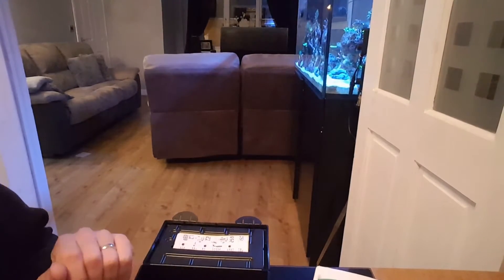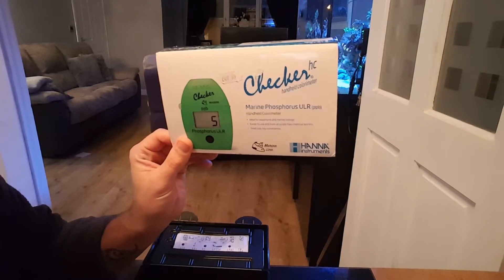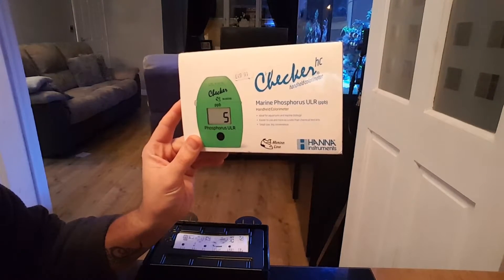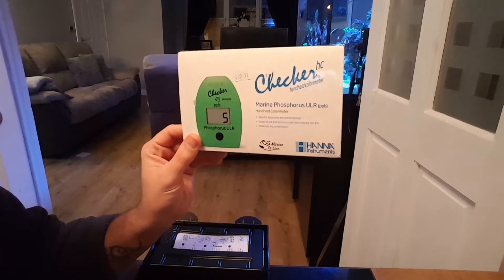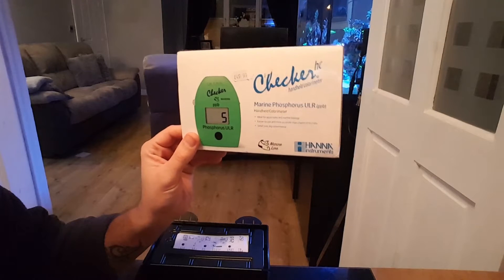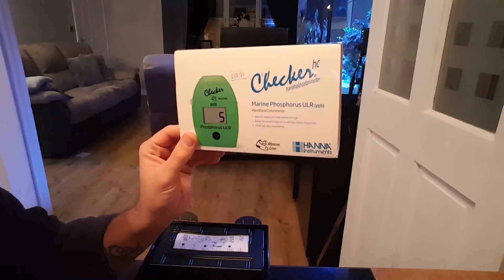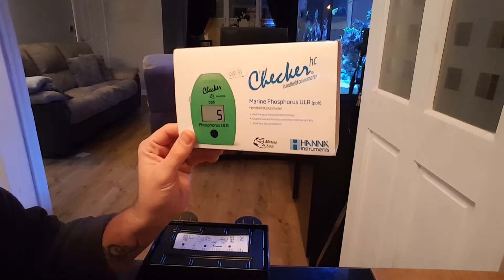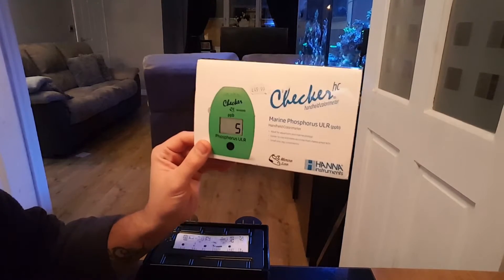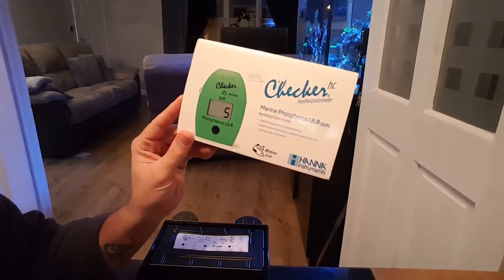Hello, welcome to Recommunity Worldwide. Today I want to talk about the Phosphorus Hanna Checker. A lot of people ask what's the difference between the Phosphorus and the Phosphate. The Phosphorus is better for marine because it tells you in parts per billion rather than parts per million, which is a more accurate reading. So if you've got a marine tank, this is what you want.